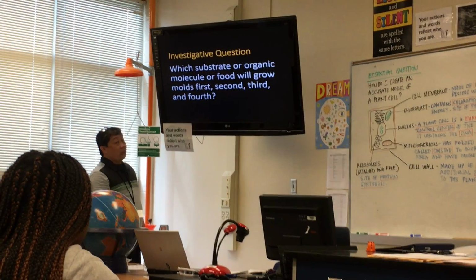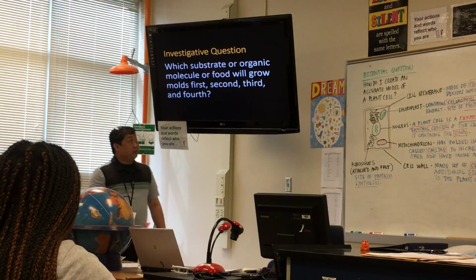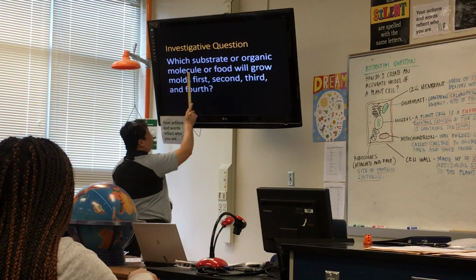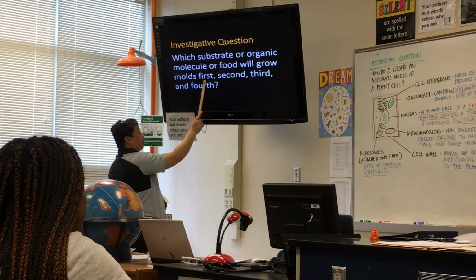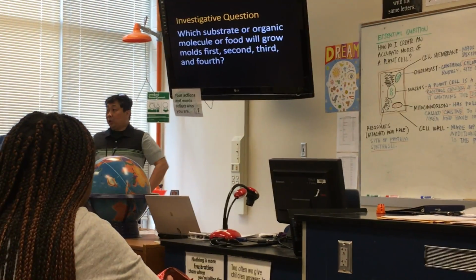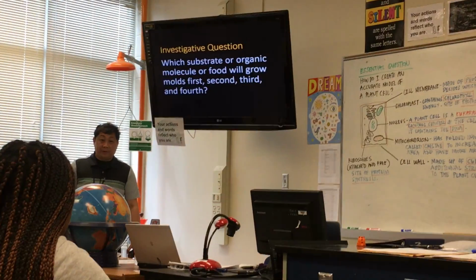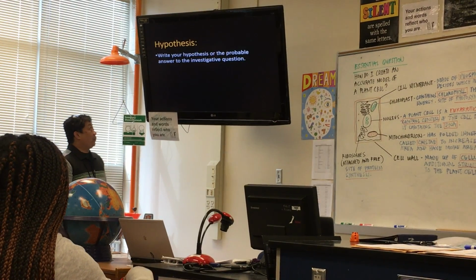Now, our investigative question, which you will be answering, is which substrate or organic molecule or food will grow molds first, second, third, and fourth? So we'll be ranking them. Which of them will be growing mold first, and then second, and then third, and fourth?